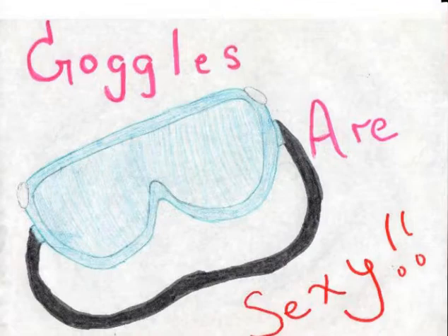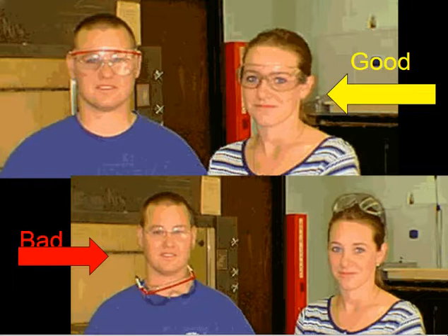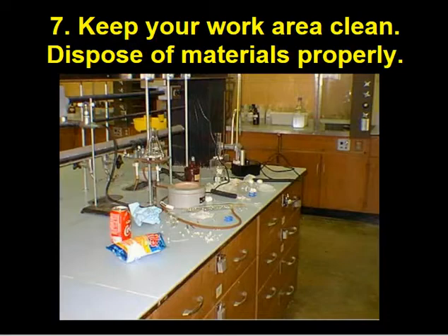And goggles are sexy. This is a poster that a student created a few years ago to just illustrate the fact that goggles are necessary. Now, are you really going to look sexy in goggles? Probably not. But what would be worse, wearing goggles or getting hurt and potentially losing your eyesight? So make sure you wear the goggles around the eyes, not around the neck or the forehead.